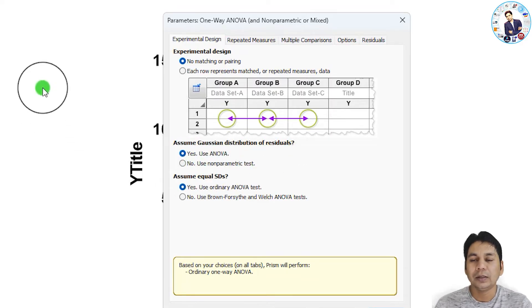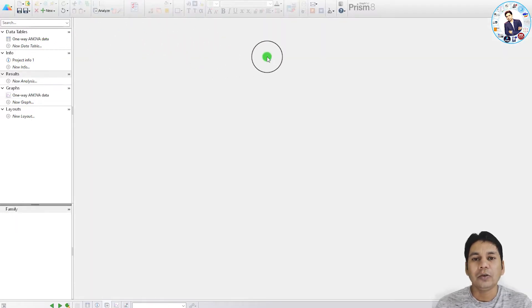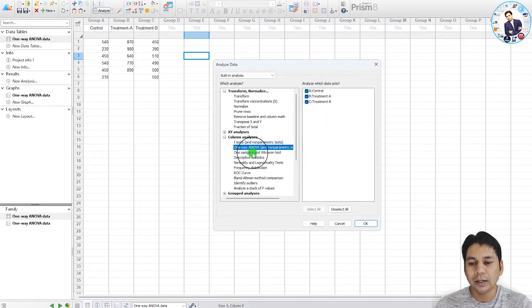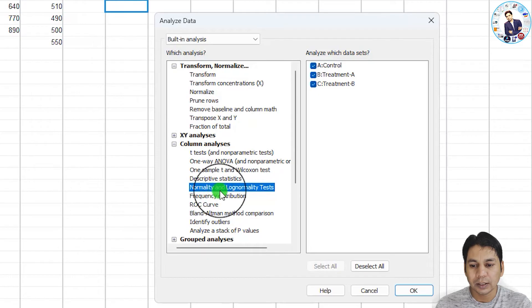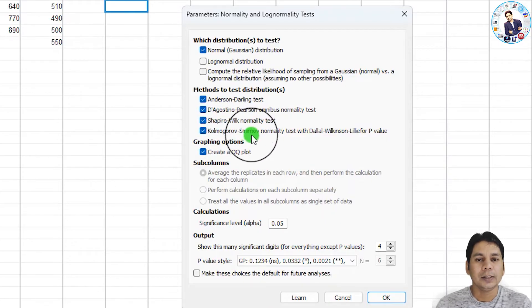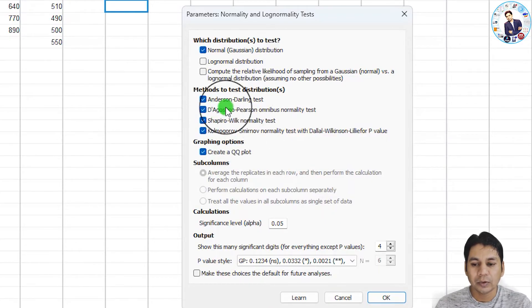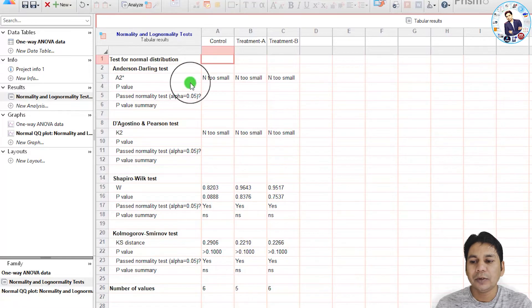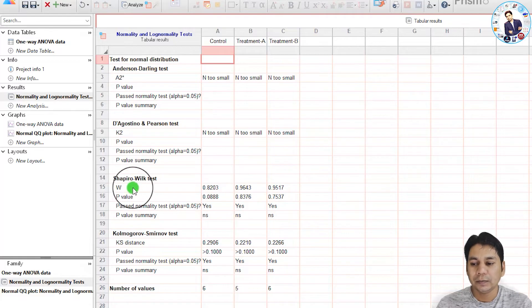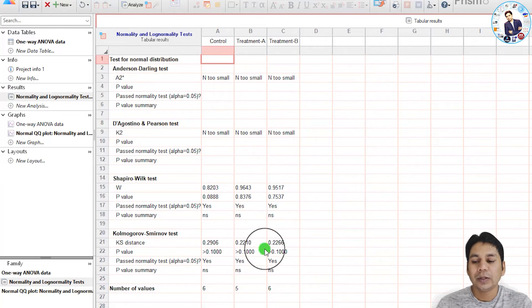You also need to assume a Gaussian distribution of residuals. To verify this, you can perform a normality test. Select your data, click 'Analyze', and in the column analysis select 'Normality and Lognormality Test', then click 'OK'. By default, all tests are selected, so leave that unchanged and click 'OK'. The first two tests show the sample is too small to perform, but the last two tests show the data passes the normality test — yes for all three groups — confirming the data is normally distributed.